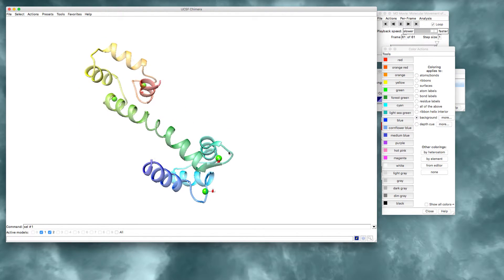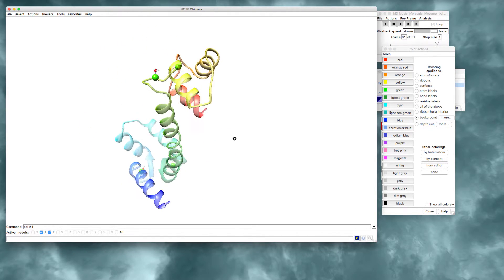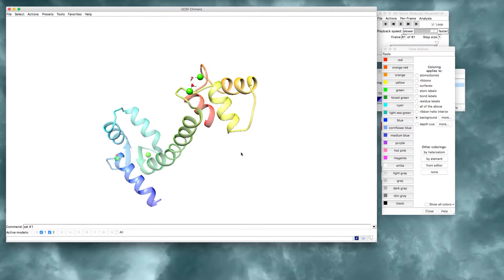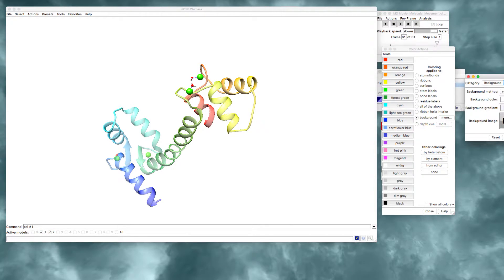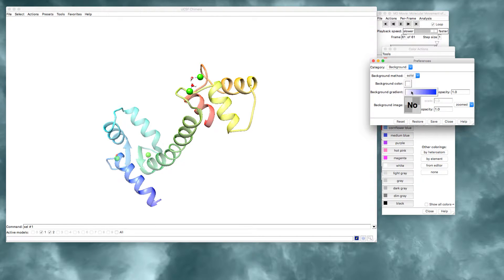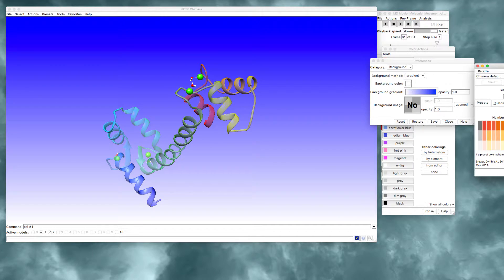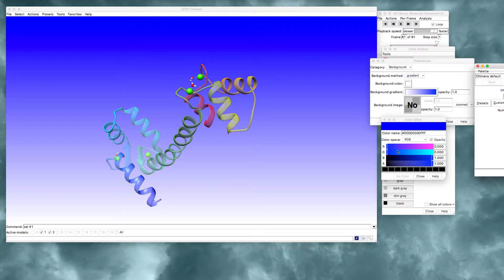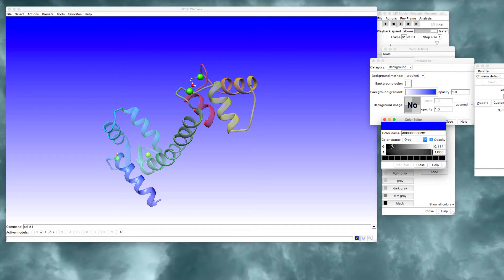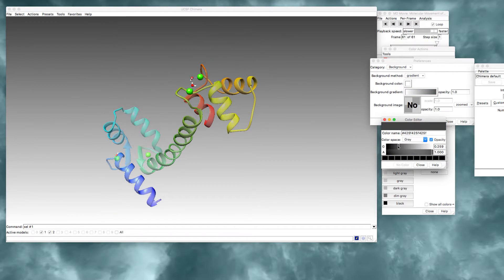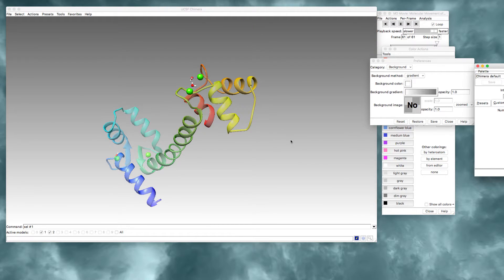You can also do something a little bit more complicated if you click on the more feature and you can do a background gradient. So let's do that. Here we go. I go to custom. I'm choosing two colors and I'm going to make this gray. So now I have a gradient from white to gray and I like this.